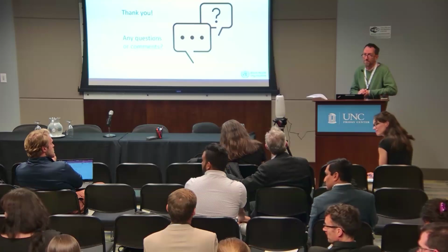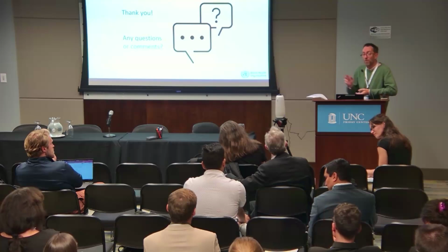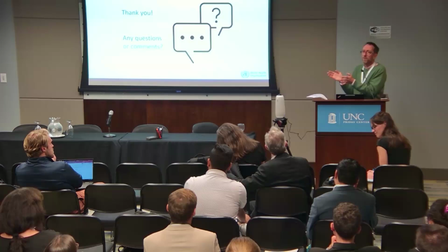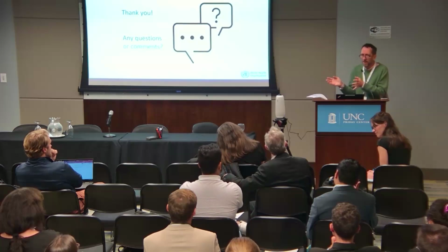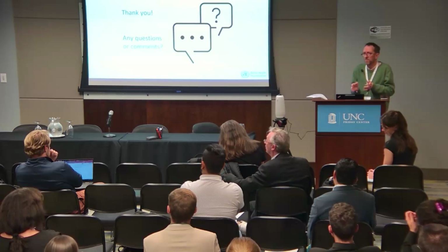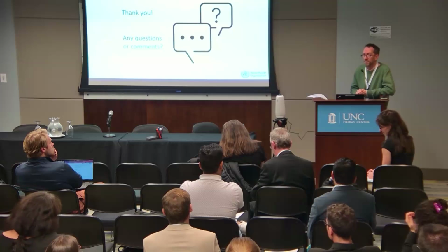Are you planning to publish results with regard to these parameters as well? Well, say the Fluidion report is online, and we look at the manufacturer claims, and they claim a certain time to result, so we check the results at those times and validate the manufacturer claims.